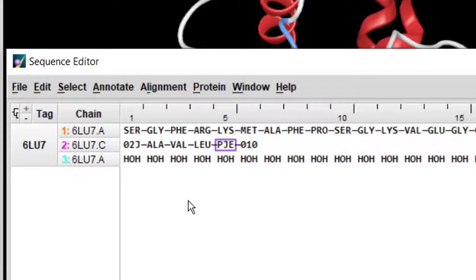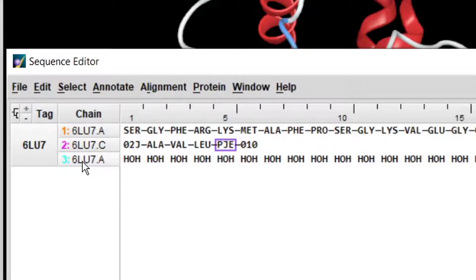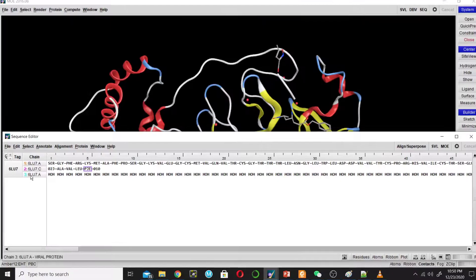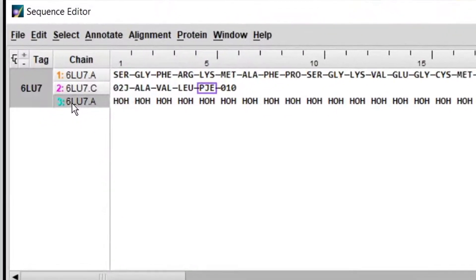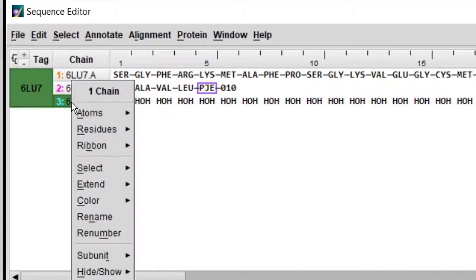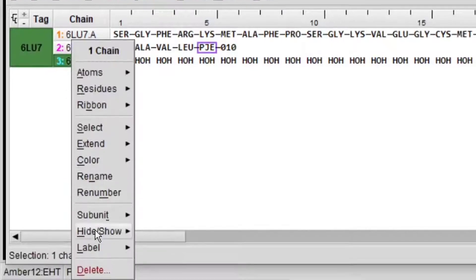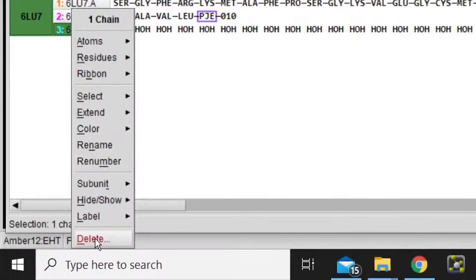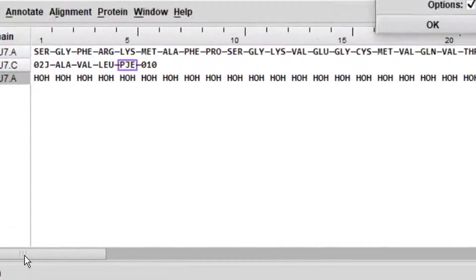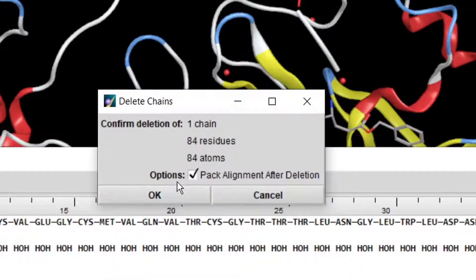So we will remove the water molecule. Move your cursor here, click on this, then right click, and then delete, and click OK.